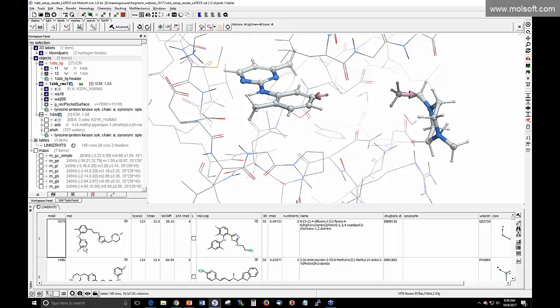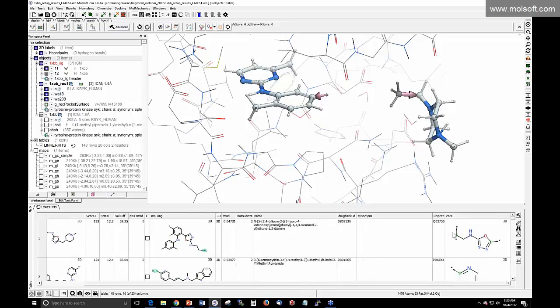It has our original fragment on this side and this side, and then it has this linker region here. It reports the ligand that's taken from DrugBank and incorporated as a linker, so you can see where it's added it here. This is the original, and the final one is just the core. This is the core linker region.